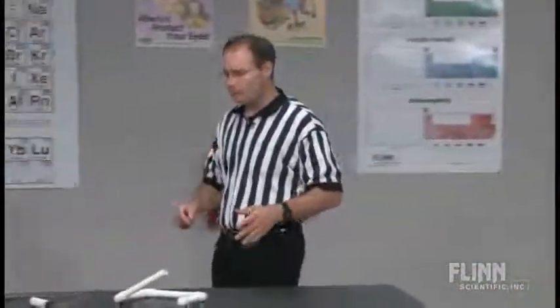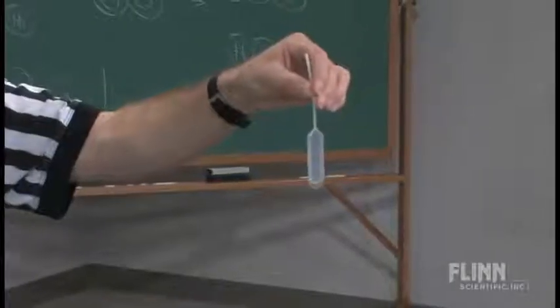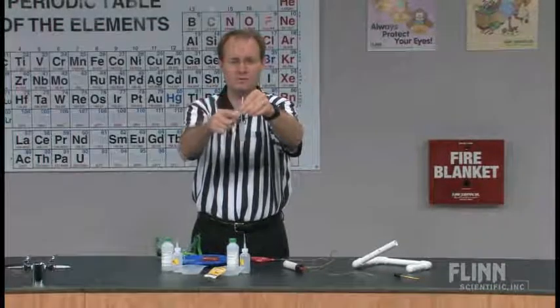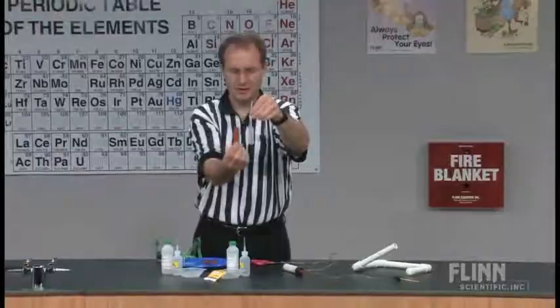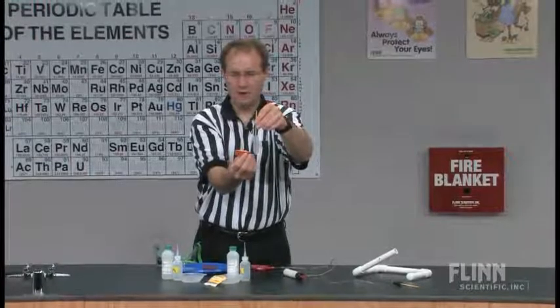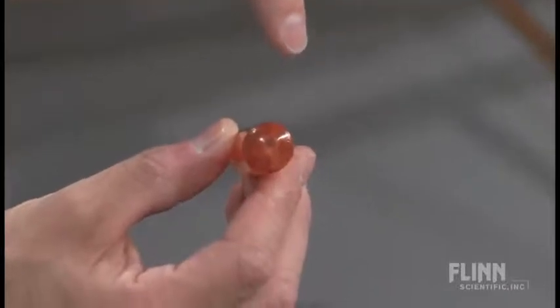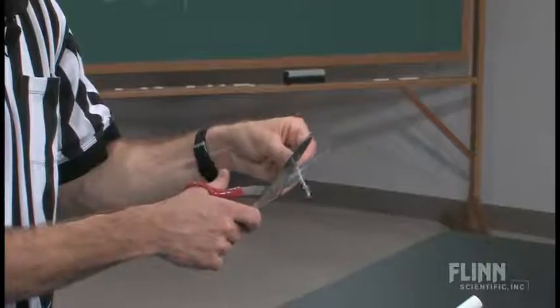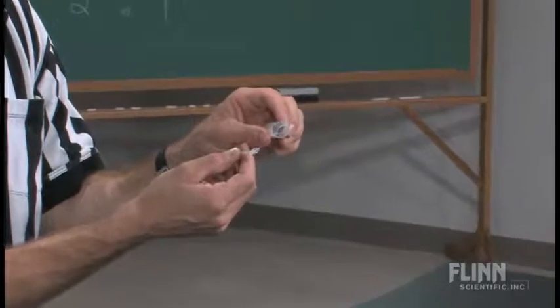What I've got over here would be a number of things. We start with one of these, which is a super jumbo size type of pipette bulb. I need to use scissors to remove the thin stem, because where we are going it will look something like this. This one has been dyed orange in color, but you can see, if I hold it up here, the opening on the end, which kind of itself looks like a little football. We simply take a pair of scissors and cut it just like that to create the little opening.